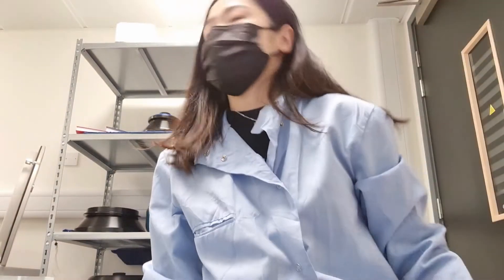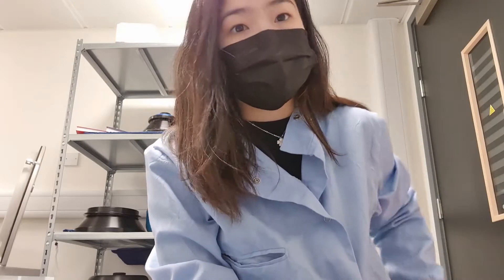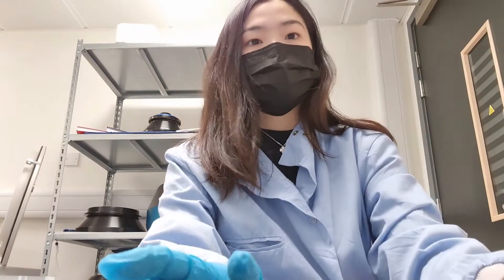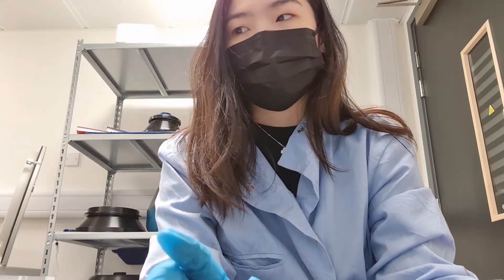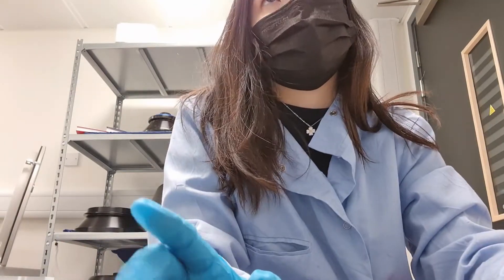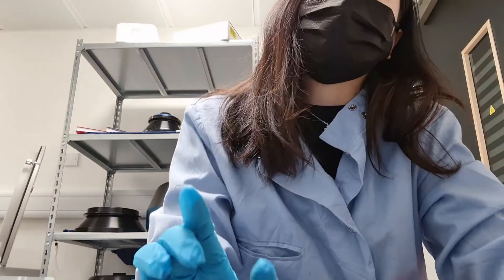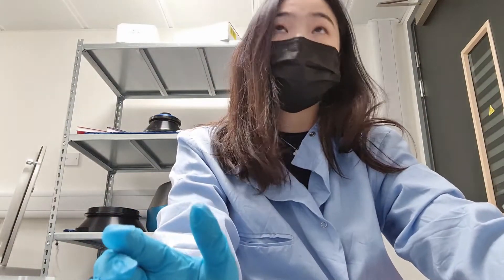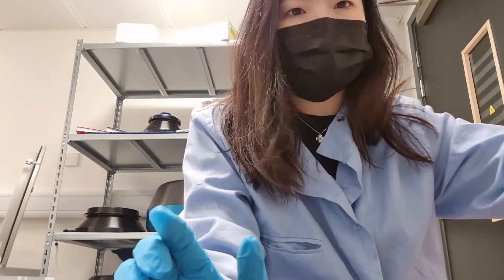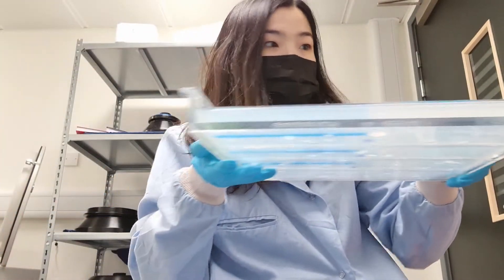I stopped filming for the second half of the day because things got a bit hectic. I did something stupid — I miscounted the number of wells on my comb, so I thought I could load enough samples but I miscounted by one or two, so I didn't pour enough gel. I needed to pour another gel, which took another hour to set and another hour to run — about two hours more than it should have. The results from the previous gel don't look too great, but here's the new gel and we'll see how this one goes.